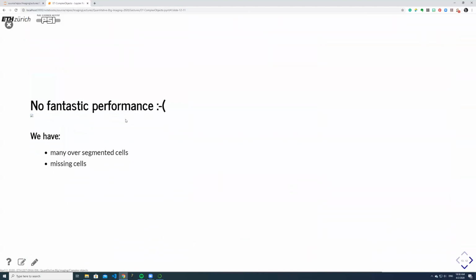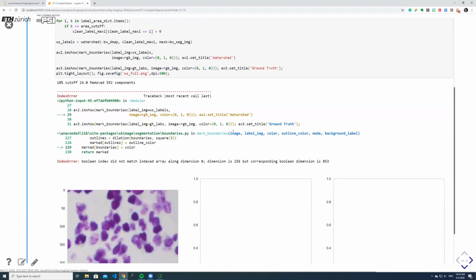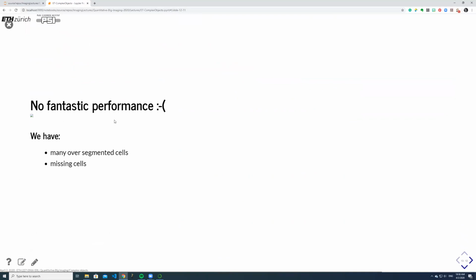So we did not get the performance we wanted, and that one didn't execute. Okay, let's go back again. So let's execute this one. Takes a little while. Oh no. Okay, so that wasn't meant to be. I go to the next slide. Anyway, I was just about to show the same panels I had before.